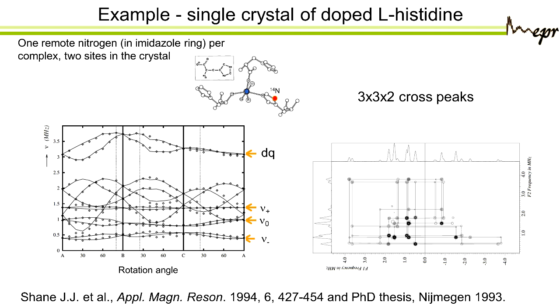Here is a single crystal experiment. It's an ESEEM experiment where the measurements were done for different orientations of the crystal, and we can see here all the lines.